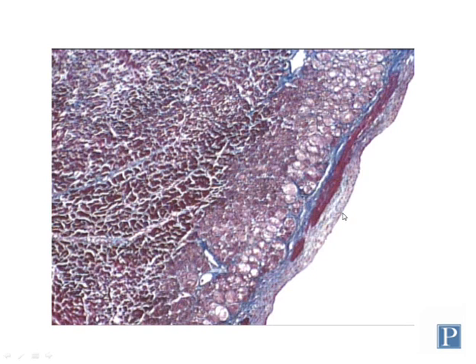Deep to the endothelium, you have the subendothelial layer here, which contains connective tissue primarily. Many of these fibers are type 1 collagen fibers, which in this particular section are stained a bluish color.